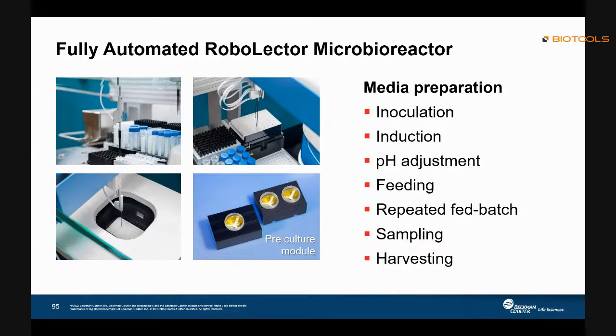And if you see from the video, when we introduce a sample inside the BioLector, the shaking is still on. This is actually quite important because we do not want to interrupt the fermentation at any time.